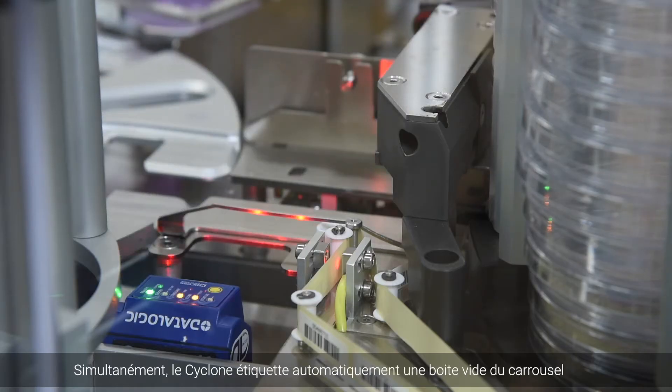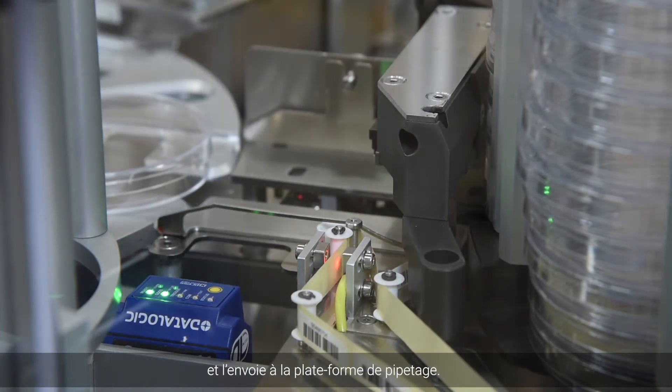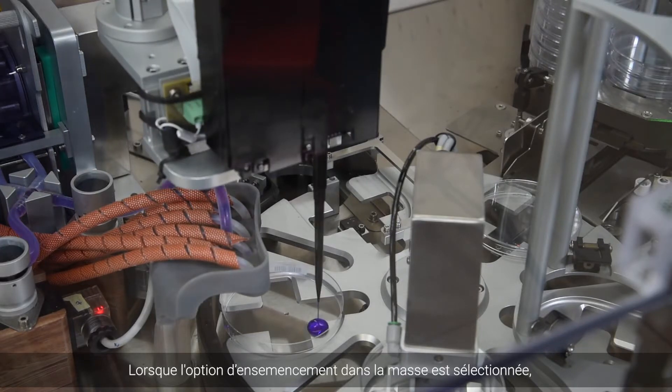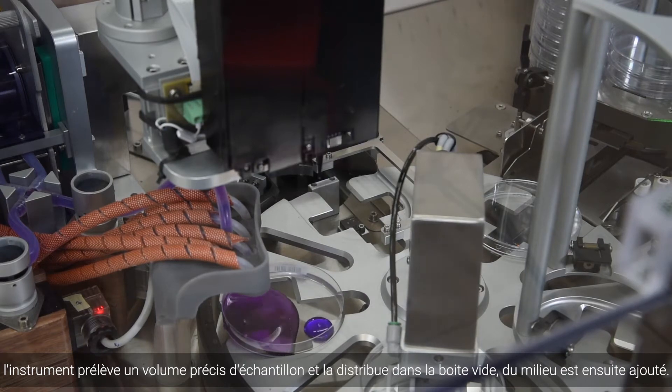Simultaneously, the Cyclone automatically labels an empty plate from the carousel and sends the plate to the pipetting platform. When the pour plating option is selected, the instrument takes a precise sample aliquot and dispenses it into the empty plate, and molten agar is added.